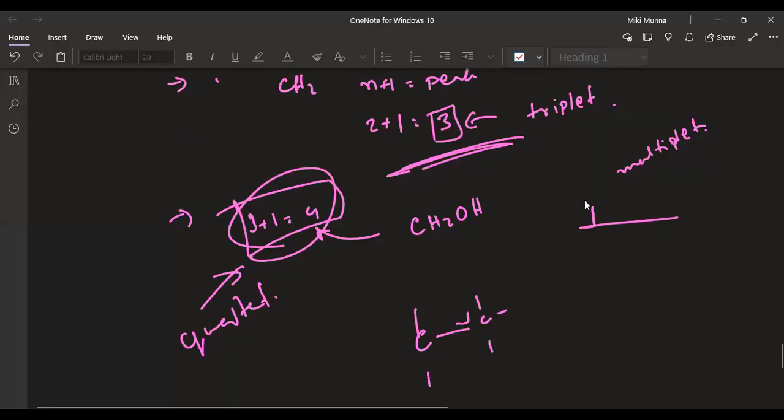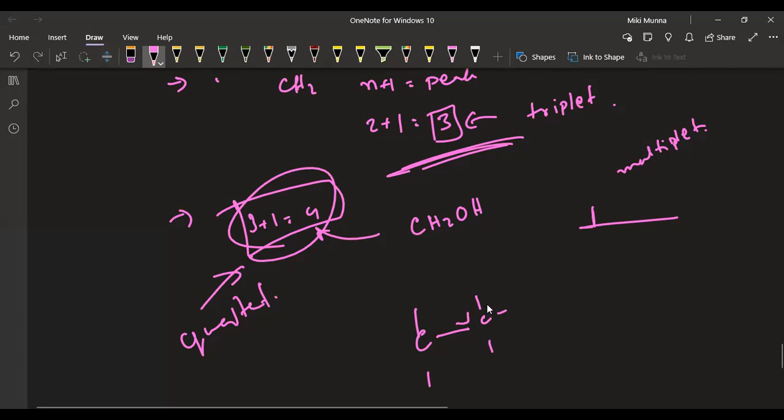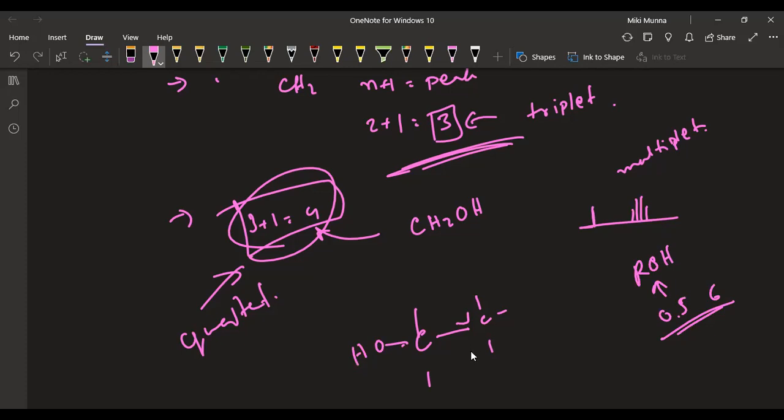Here we can observe that these groups are present between 2 and 4, and that is a possible case, as they have mentioned ROH can be between 0.5 and 6. That means this is what defines this group, isn't it?